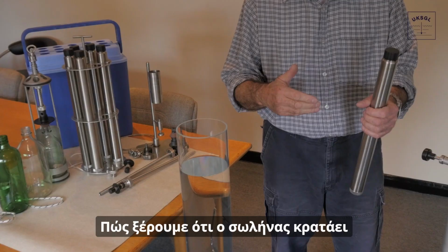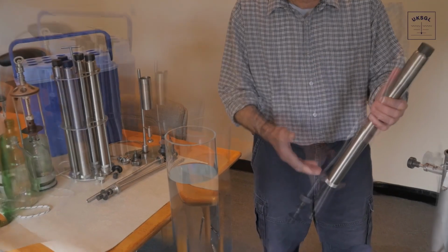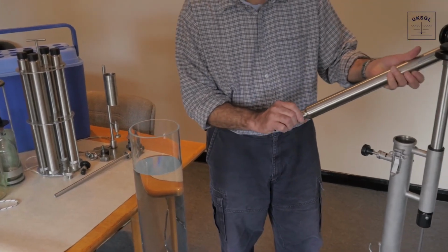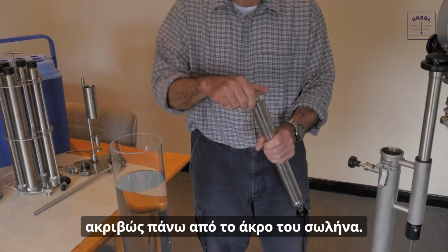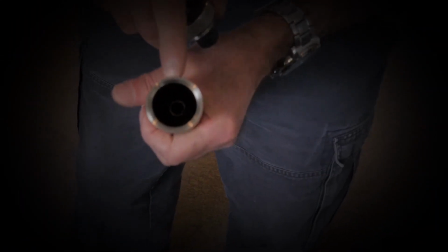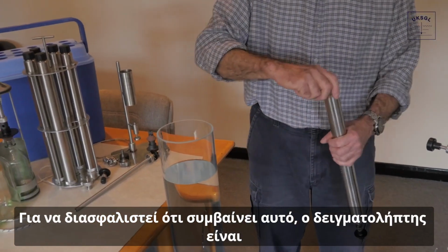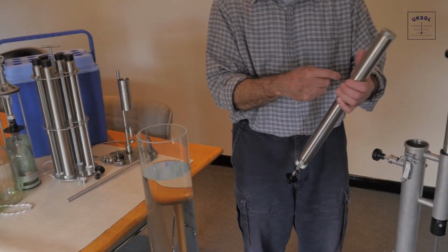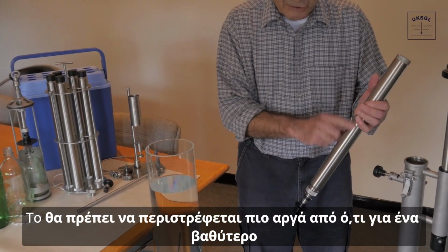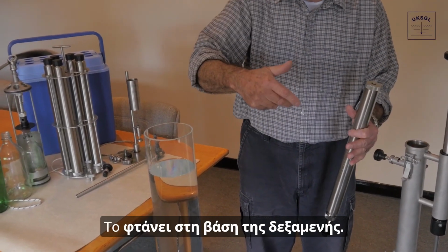How do we know that the tube holds approximately 80% of the volume of the sample, which is a requirement of the regulations? The probe inlet pipe reaches 3/4 of the length of the outer tube, so the liquid should be just above the pipe end. To ensure this happens, the sampler is lowered at a rate commensurate with the depth of the tank. So, for a shallow tank, the winder handle should be turned slower than for a deeper tank, the aim being to have the sampler at 80% capacity just as it reaches the base of the tank.